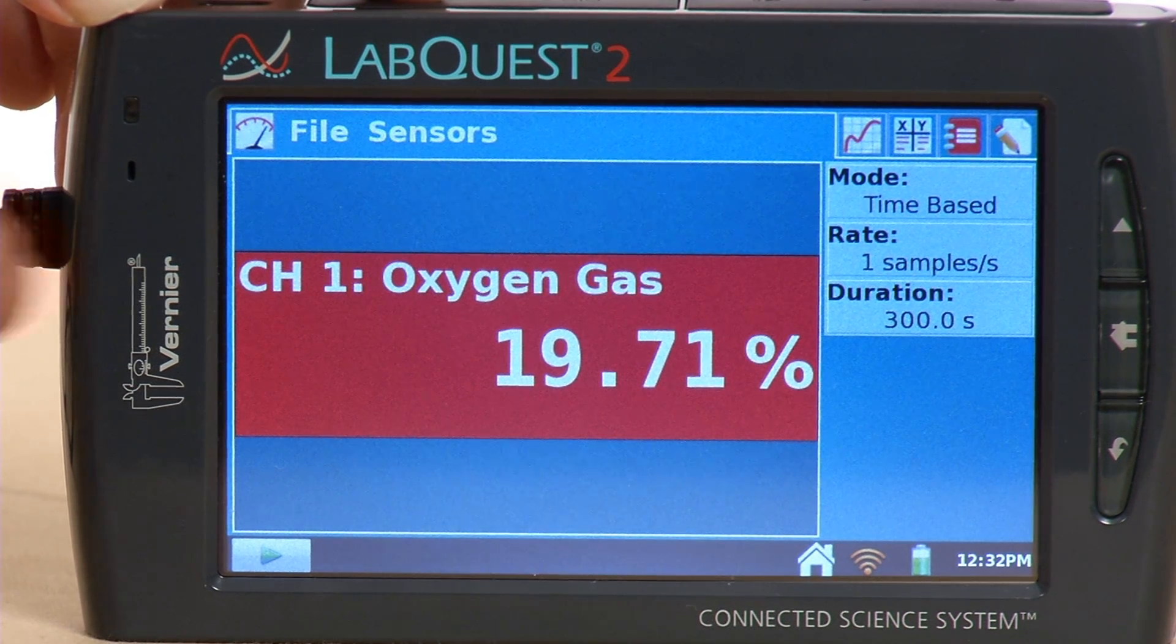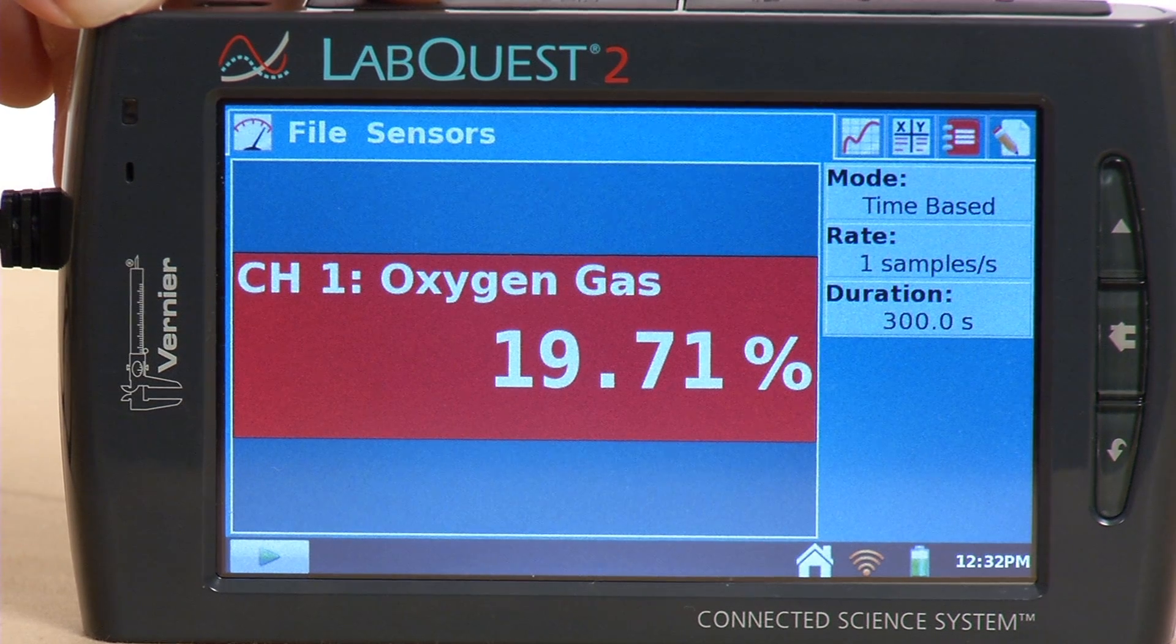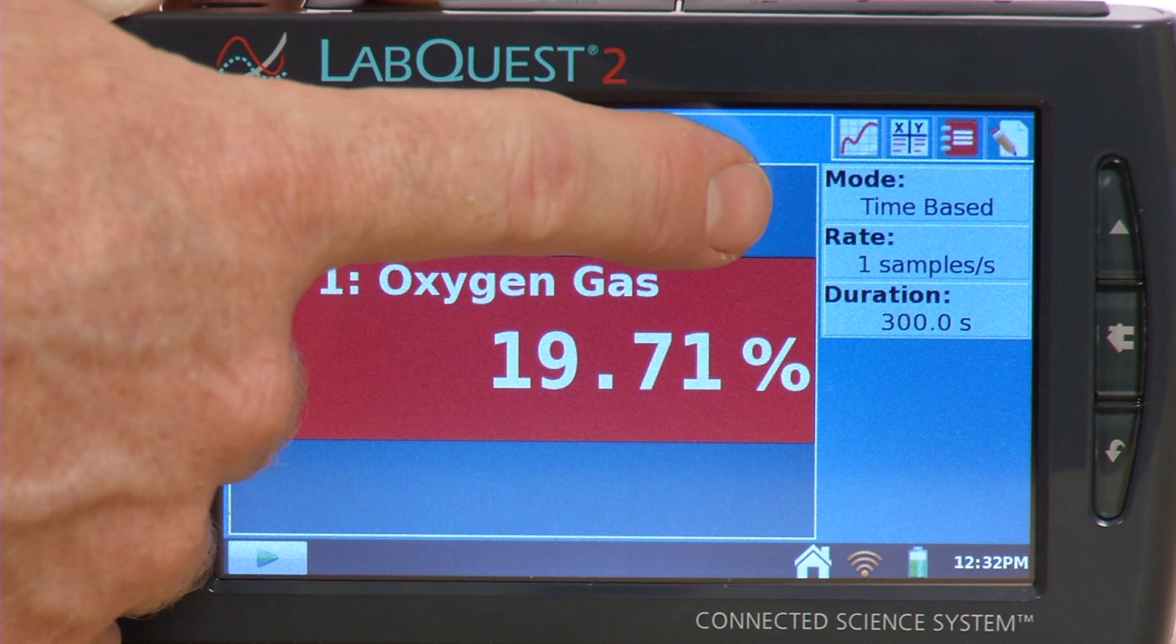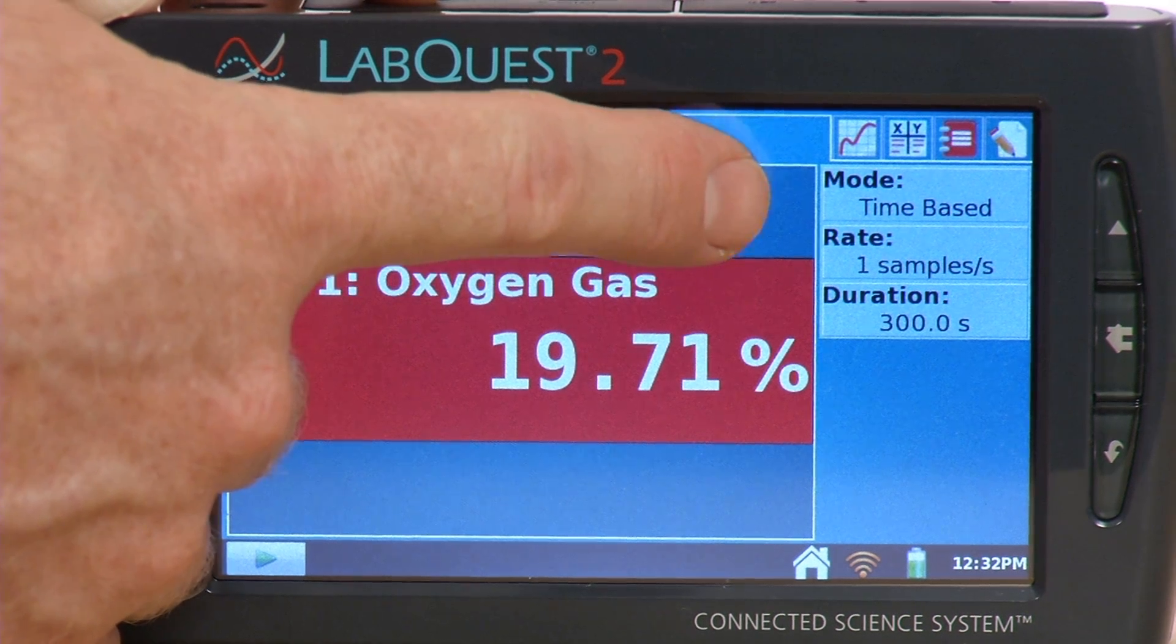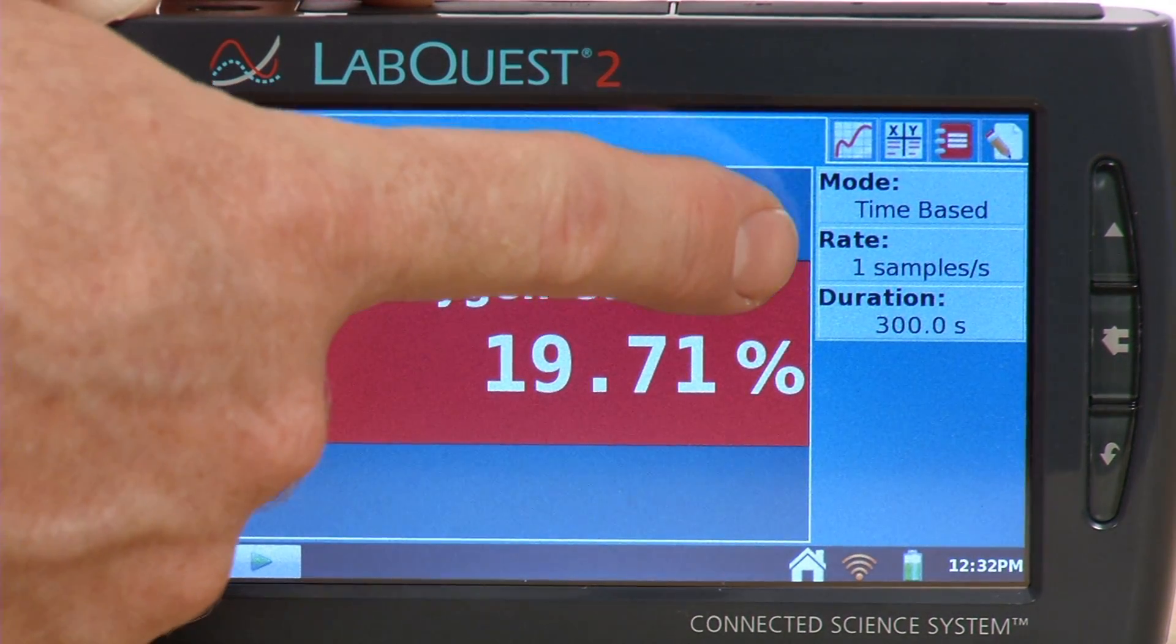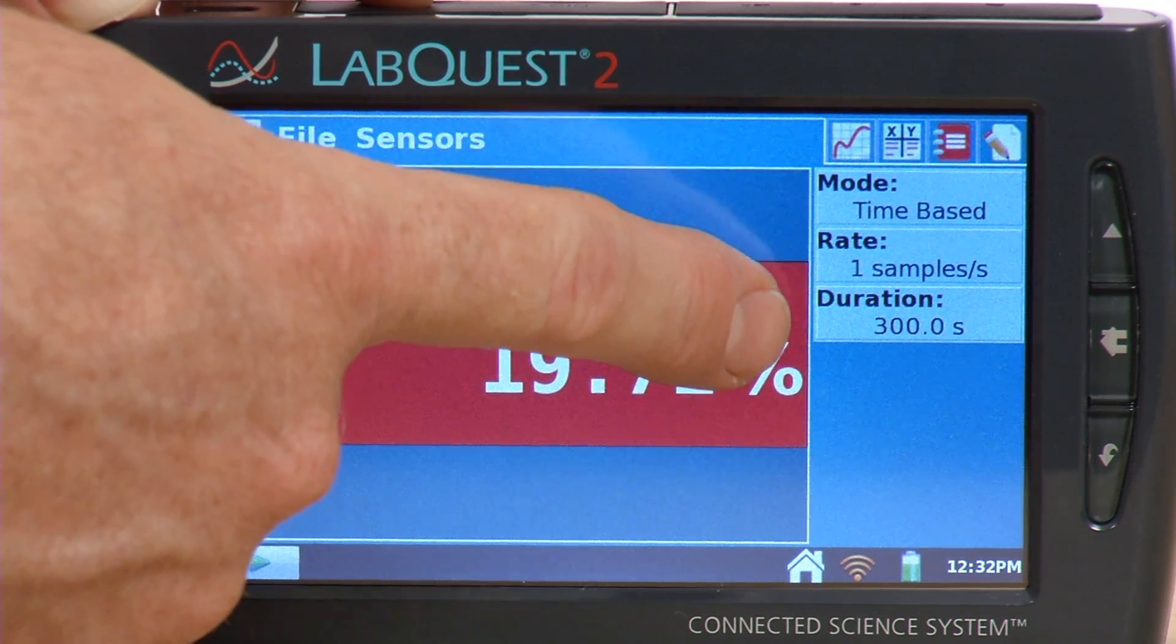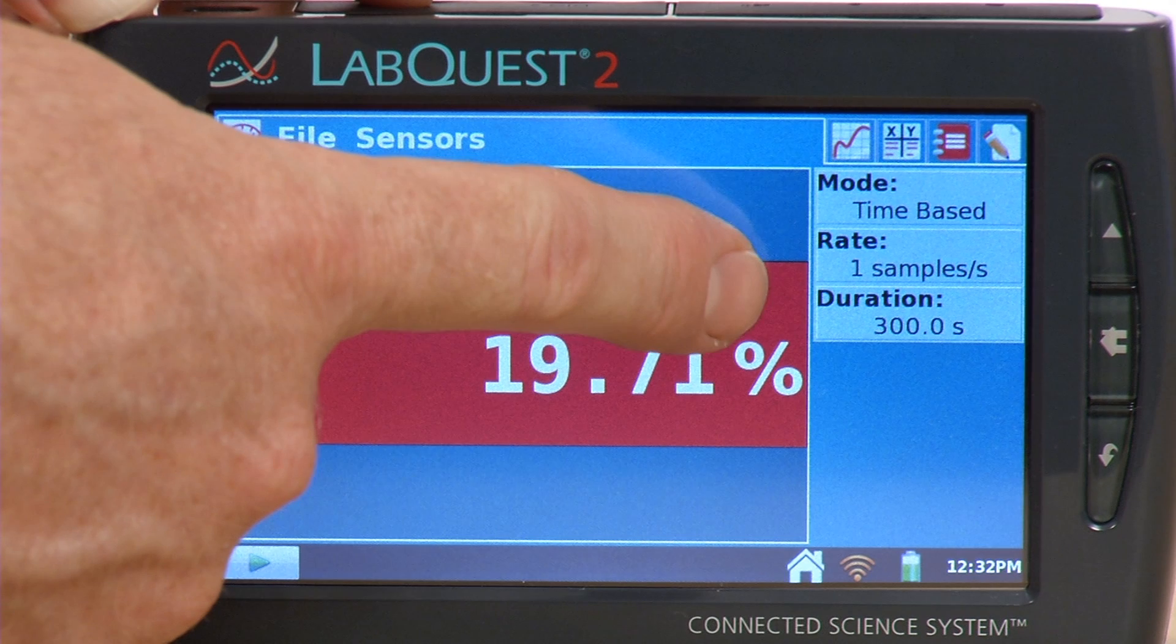Now if you'll look to the upper right corner there, we'll see our default collection parameters. So the mode is time-based, meaning we're looking at the oxygen concentration as a function of time. The default rate is one sample per second. And the default duration is 300 seconds, or five minutes.